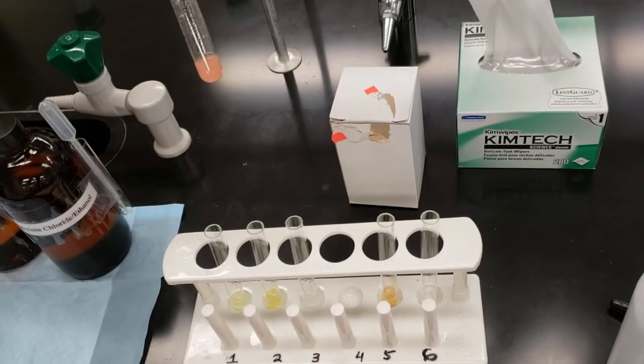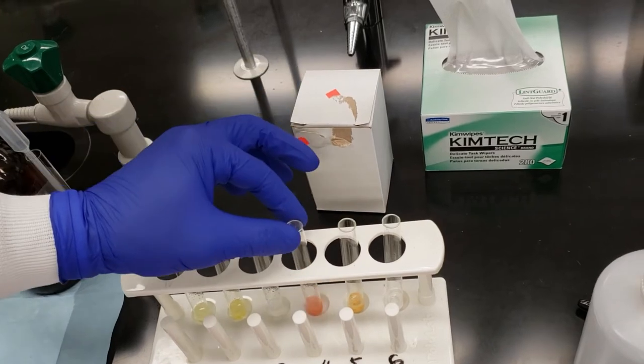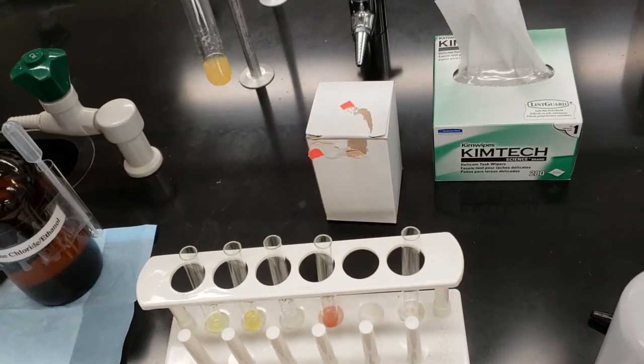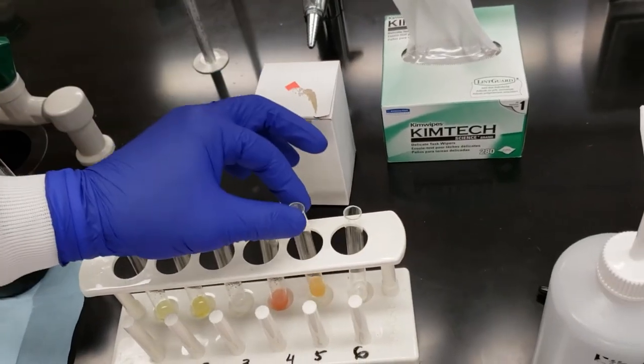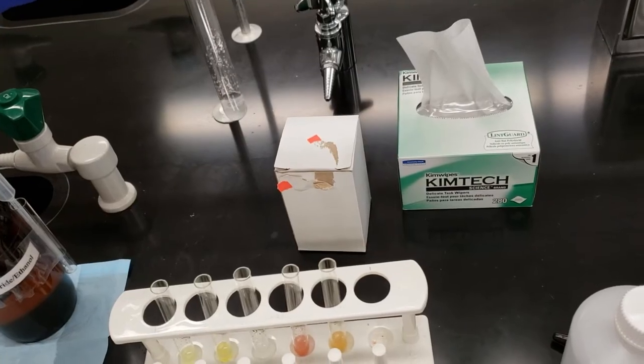Here we've got our orange red with again some particulate. Yellowish orange here for number five. And again a white translucent for number six.